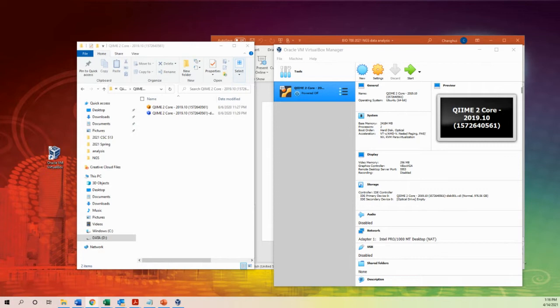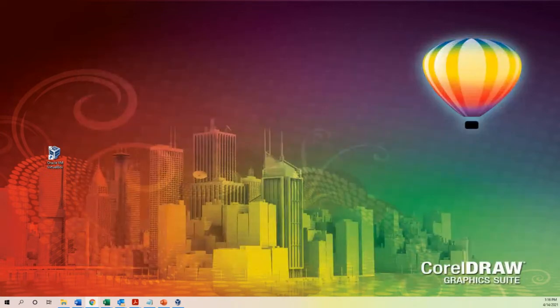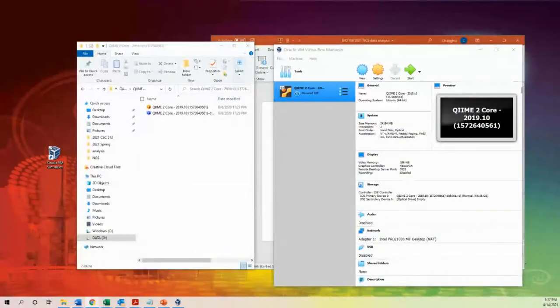Why does it take so long? It should be very quick. I realized it didn't unzip mine, so this is why. I downloaded it that day, but I didn't unzip it. So now I'm trying to unzip the file currently. All right. Whenever you're done, raise your hand so that I know.